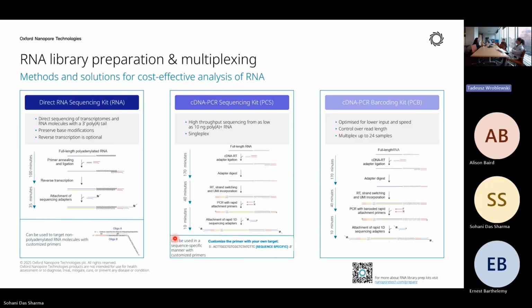But sometimes it depends on how many A's are getting added, and whether the software will be able to base call it properly. So I am not sure it would be a very optimum platform for microRNA sequencing.